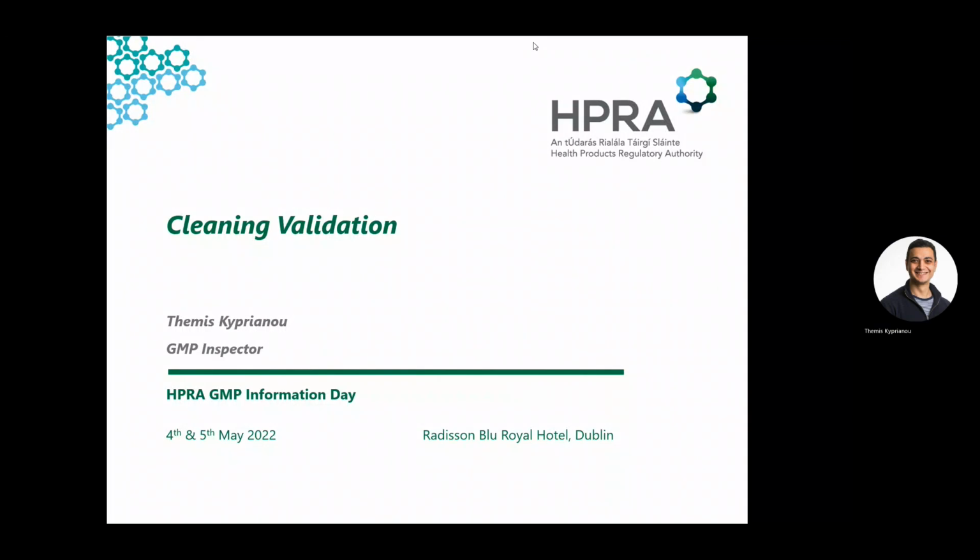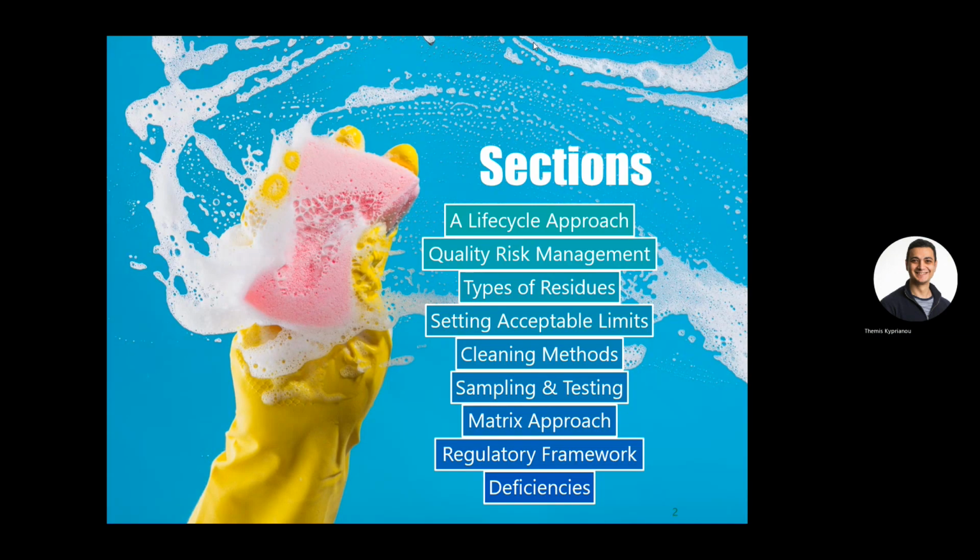Hi, everyone. As part of this presentation, we'll be covering the very interesting, yet often quite challenging topic of cleaning validation. We'll be going through a number of topics relevant to cleaning validation, such as the cleaning validation lifecycle approach, the application of quality risk management, an overview of different types of residues, approaches towards setting acceptable cleaning limits for equipment surfaces.